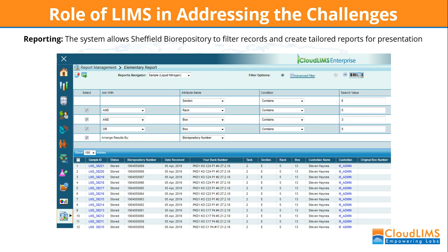Another benefit is that the system allows us to filter records and create tailored reports for presentation. Now, this is important because we handle such a large number of samples from many different groups. So we can look at producing reports for those individual groups and also financial information depending on the number of samples coming in for each individual study.